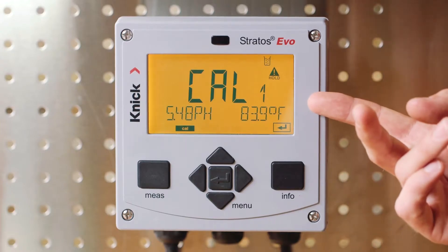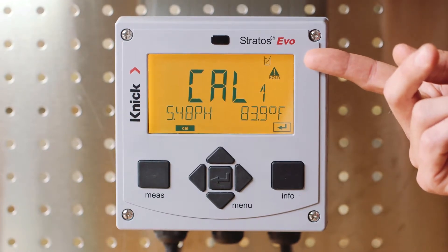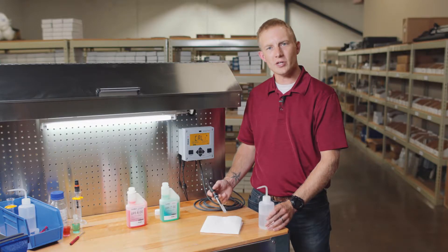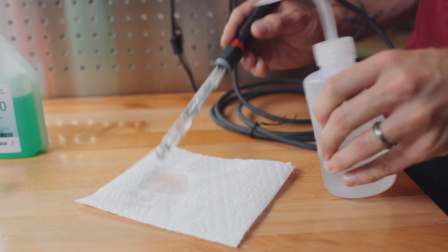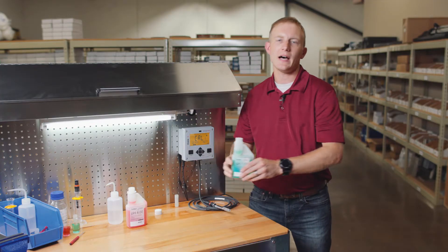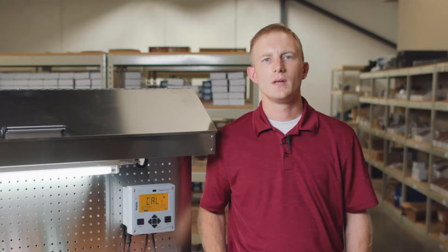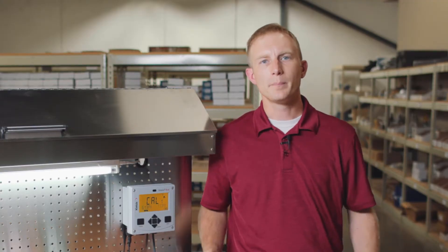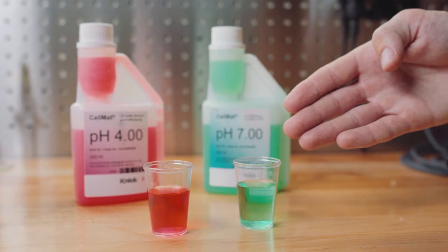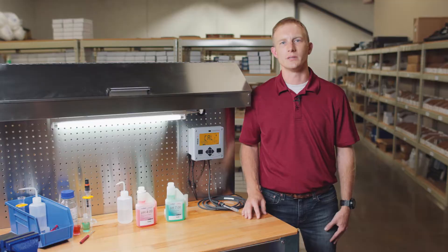Once the calibration process begins, you can see that our transmitter screen is turned yellow and the hold icon is indicating that our output to our control room is being held. First, we'll rinse our sensor with distilled water and dab dry with a clean cloth. I'm using Knick CaliMat buffers with integrated dosing cup for single dose usage. If you're not using Knick CaliMat buffers, be sure to put your buffers in separate clean containers to prevent cross-contamination and for a more accurate calibration. It's recommended to use fresh buffer solution for each calibration.